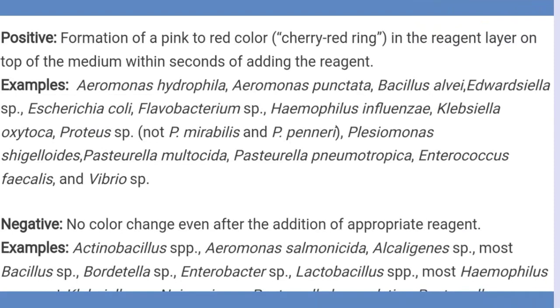If after addition of a Kovac's reagent in a tube, there is a formation of pink to red color or a cherry red color, then it is interpreted as the test is positive. If no color is observed after addition of Kovac's reagent, then the test is negative. Some organisms listed here which are tryptophanase positive or indole positive are Aeromonas, Bacillus, Haemophilus influenzae, Klebsiella, Proteus.